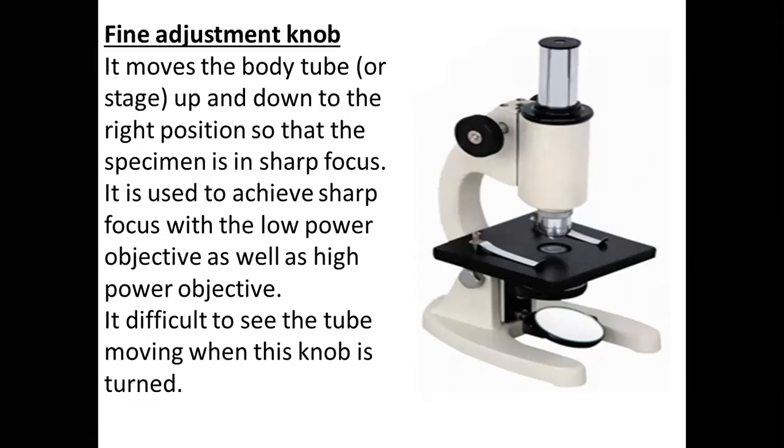Here it is not well put; it should be sharper focus. And that's when you realize exactly what you wanted to observe. And after that, you stop and you start observing. If the examiner tells you to draw, you draw.